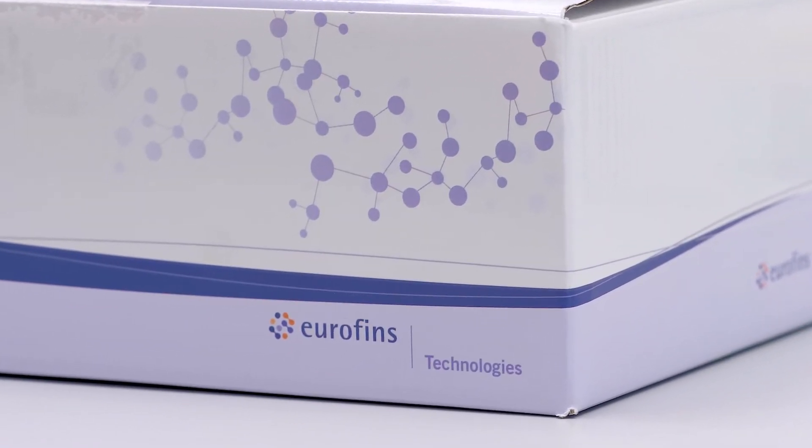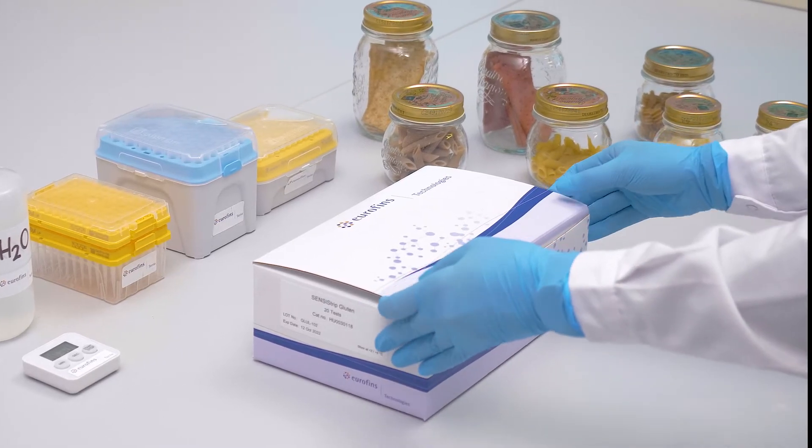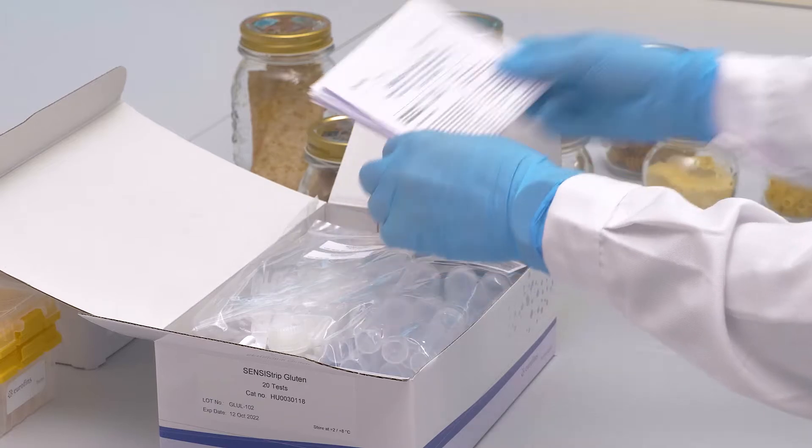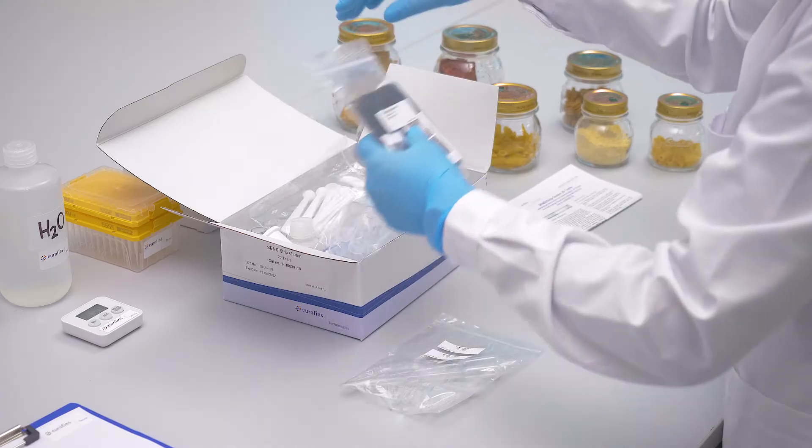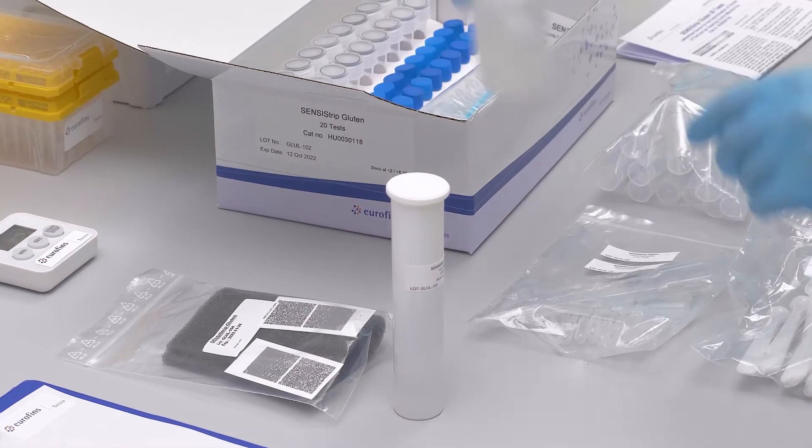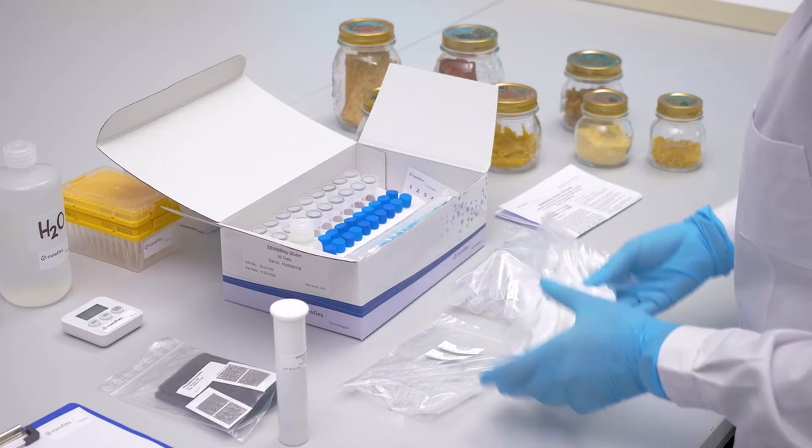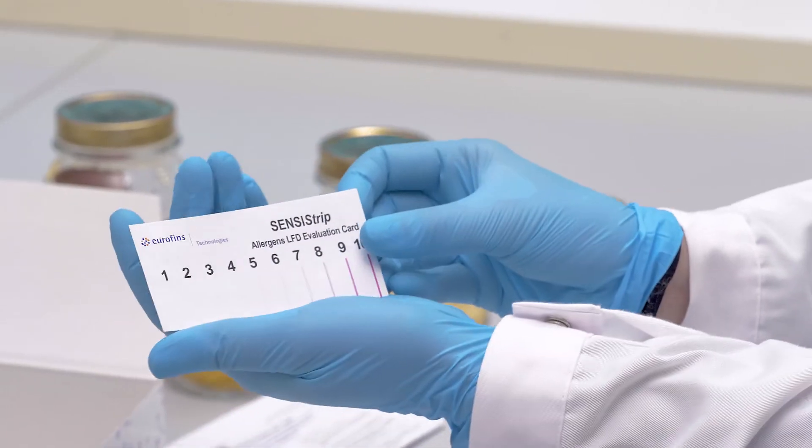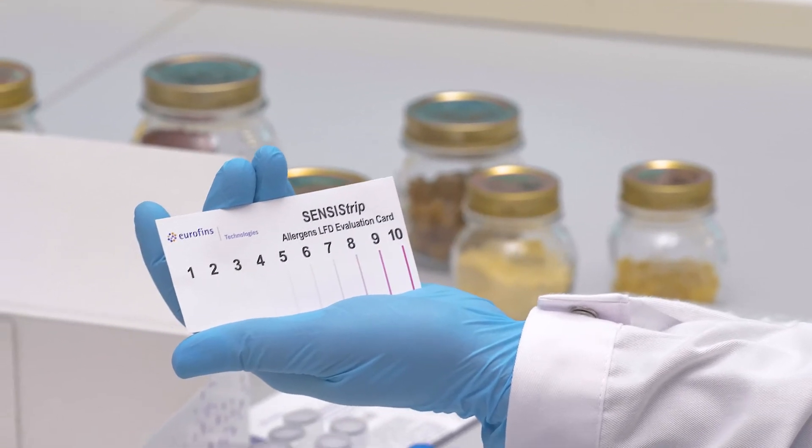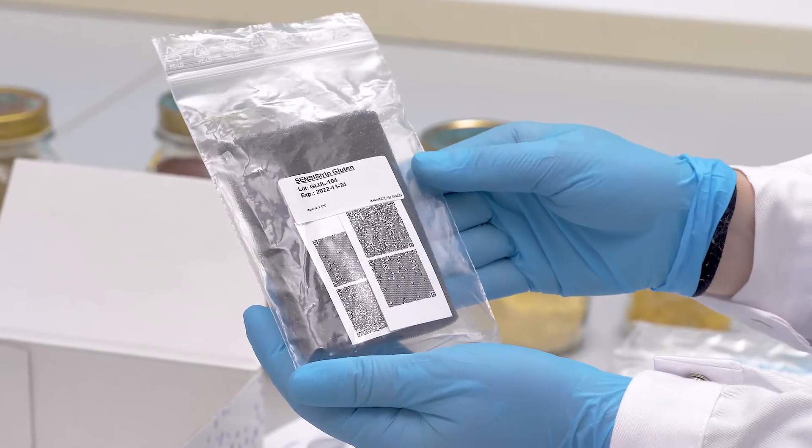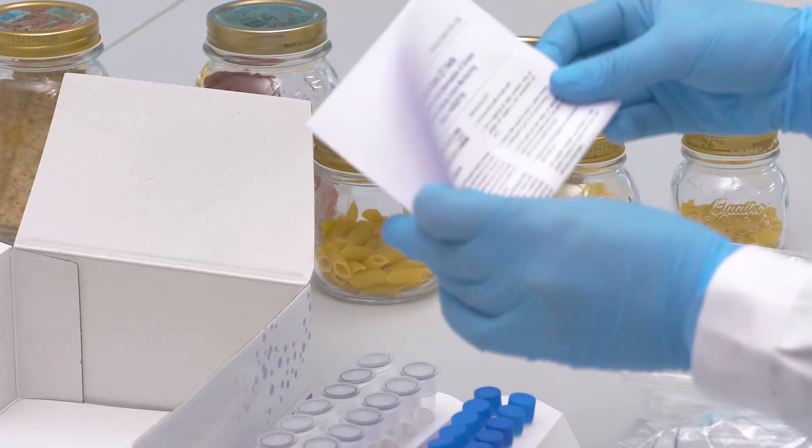The SensiStrip gluten kit includes 20 lateral flow tests for the detection of gluten with a sensitivity of 4 ppm in food. The kit includes what is needed to perform 20 determinations, including the dilution buffer, the consumables, the swabs for surface sampling, an evaluation card for qualitative analysis of results, and a QR code for digital reading, and of course the user manual.